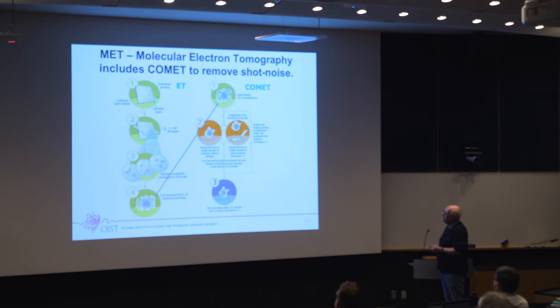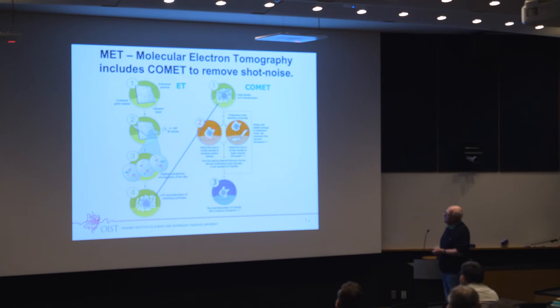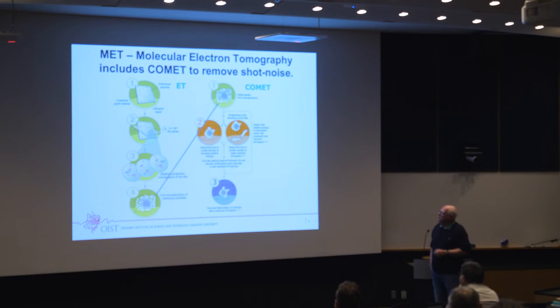This added step means that you start with this number 4 here, and then you actually refine. First of all, you check whether the 3D reconstruction fits your data or not. If it doesn't fit the data, because it could be scaling error, all kinds of things numerically, then you can fix it. But a very important thing is that, because you know the variance, you know it's a detector, it's Poisson distributed error, etc., you can actually say whether you have too much information in the system or not. So what you do is you mix these two states. Mathematically it means you have cross derivatives and all kinds of nasty stuff in there, and you can remove everything that has too much information. It sounds kind of crazy, right?